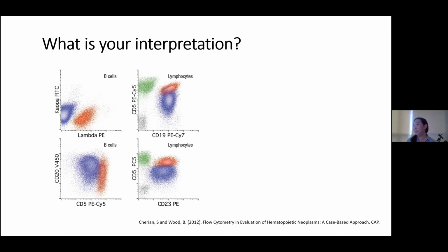So we've got BCLL as one comment. I think that one interesting point from the plot is that the expression of kappa and lambda is quite weak as well, where in more aggressive lymphoid malignancies it is usually a little bit higher up, isn't it? That's a very good observation.